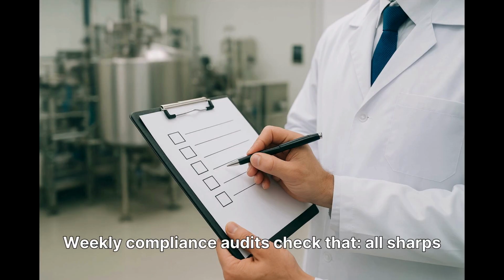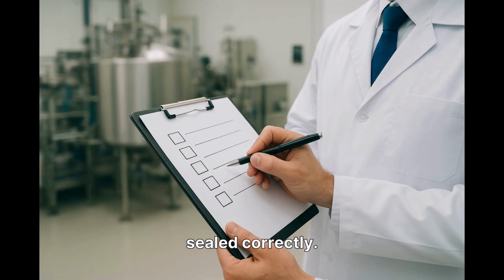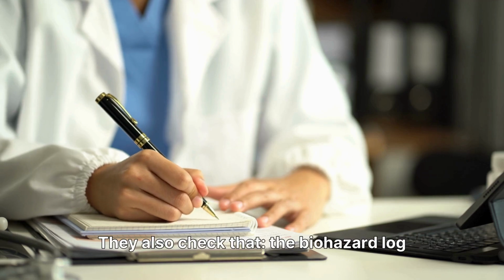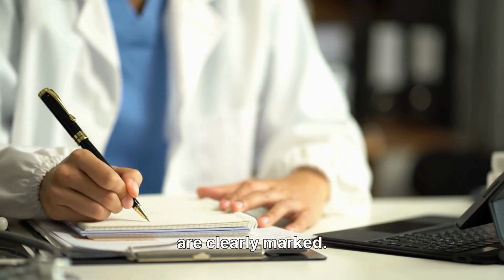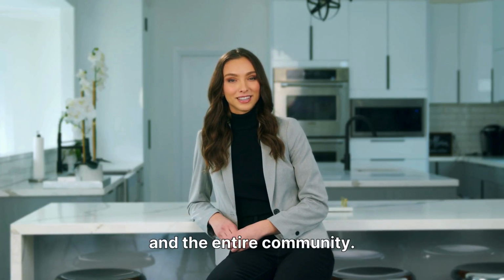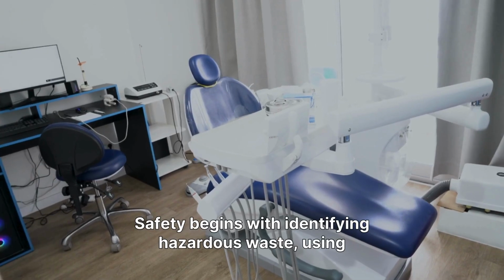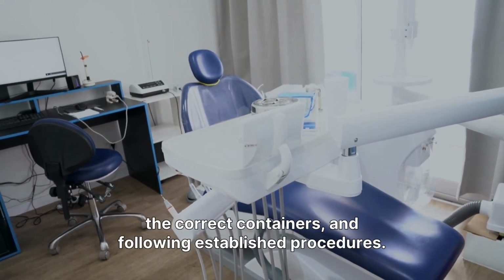Weekly compliance audits check that all sharps containers are properly labeled and containers are sealed correctly. They also check that the biohazard log is current and updated, and biohazard areas are clearly marked. Proper biohazard waste handling protects workers, patients, and the entire community. Safety begins with identifying hazardous waste, using the correct containers, and following established procedures.